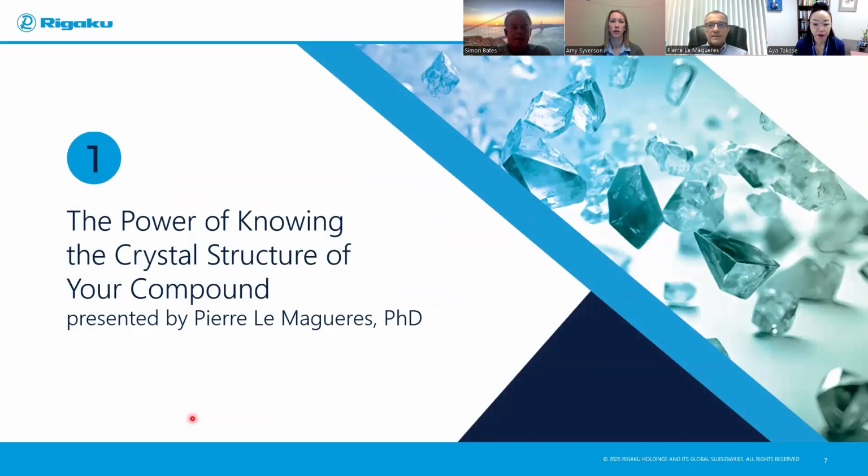Thank you, Aya and Simon, and welcome everyone to our Pharma webinar series. So this first episode is devoted to discovery, like Aya and Simon just said, and the discovery step of drug research. In the first part of today's episode, I'll be talking about the ultimate method for characterizing new compounds, and this is called single crystal crystallography. I am a crystallographer myself here at Rigaku, and my job today is to explain how powerful it can be to know the crystal structure of a compound within the frame of drug discovery.